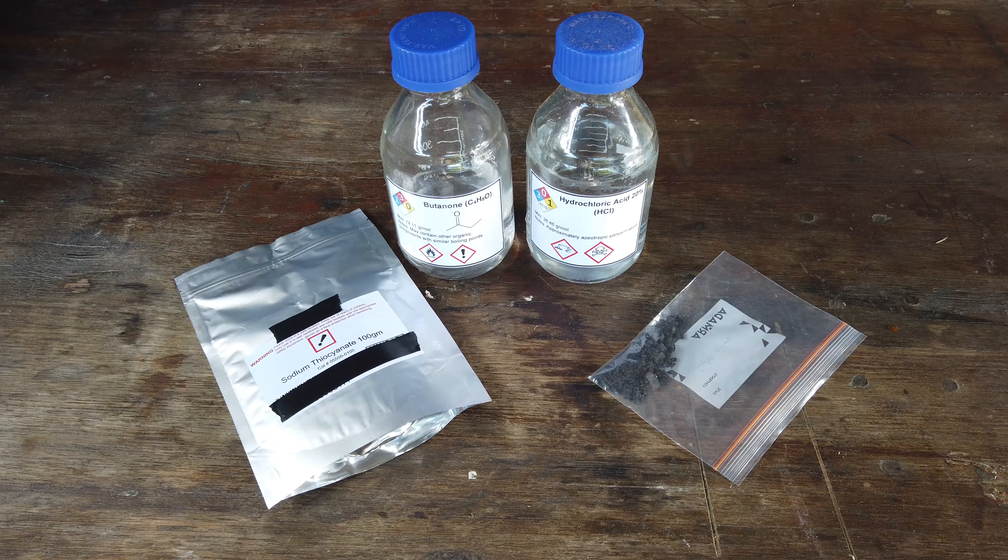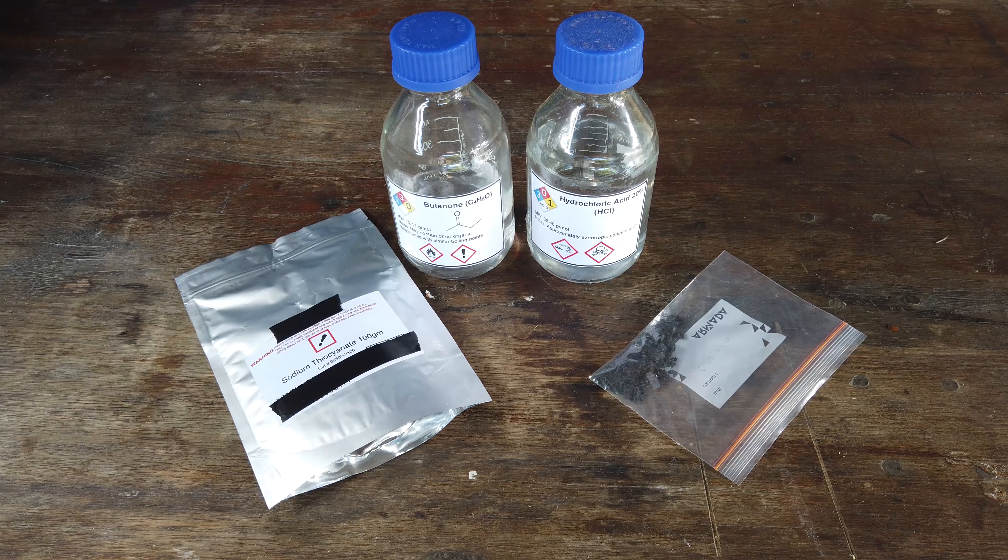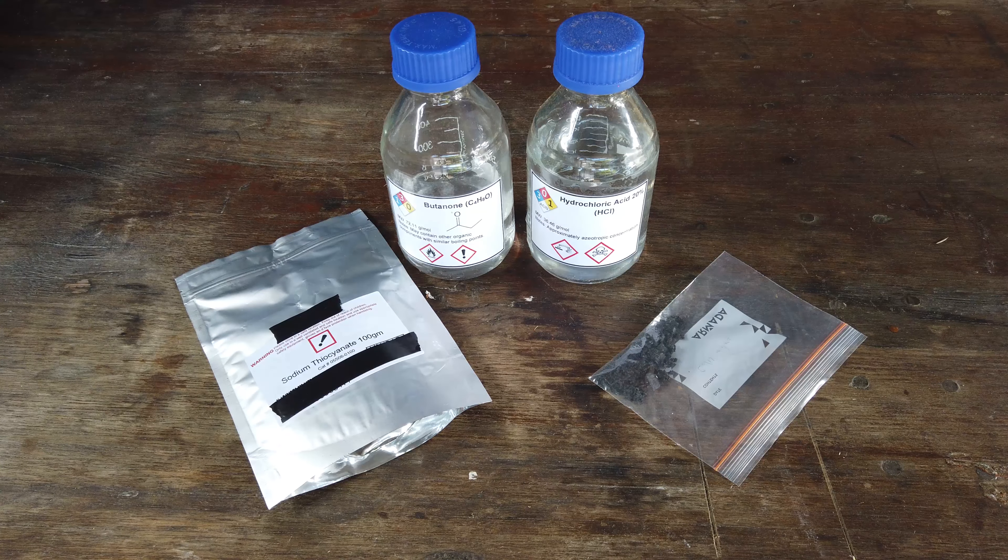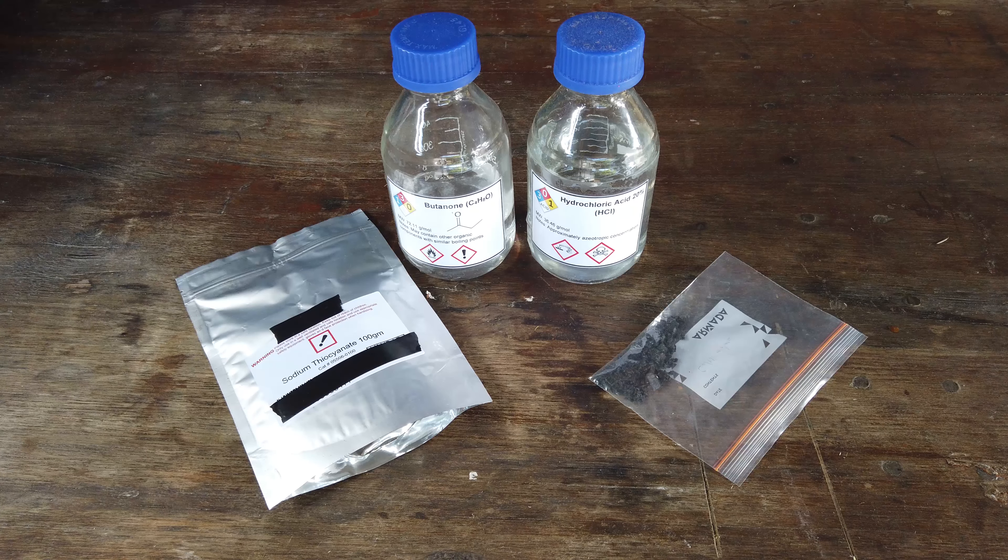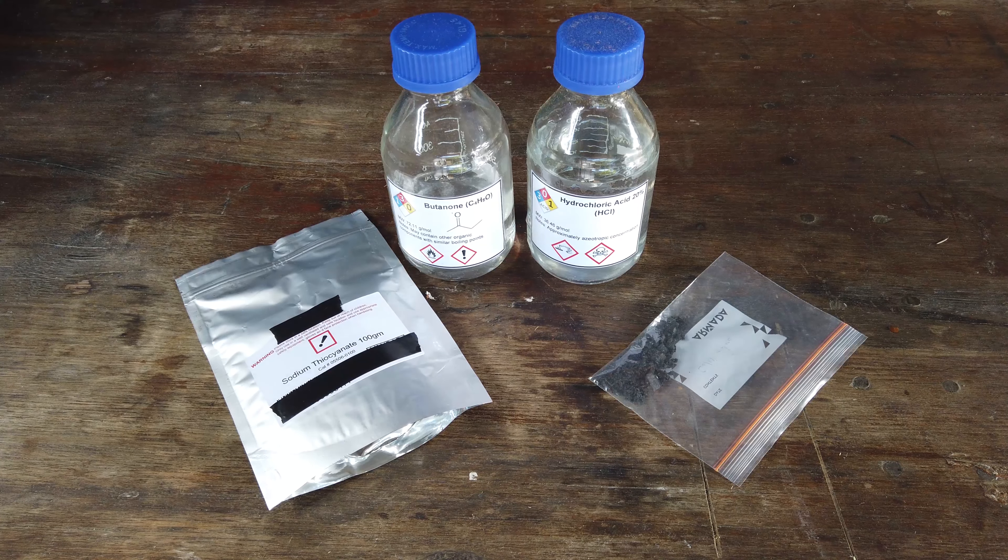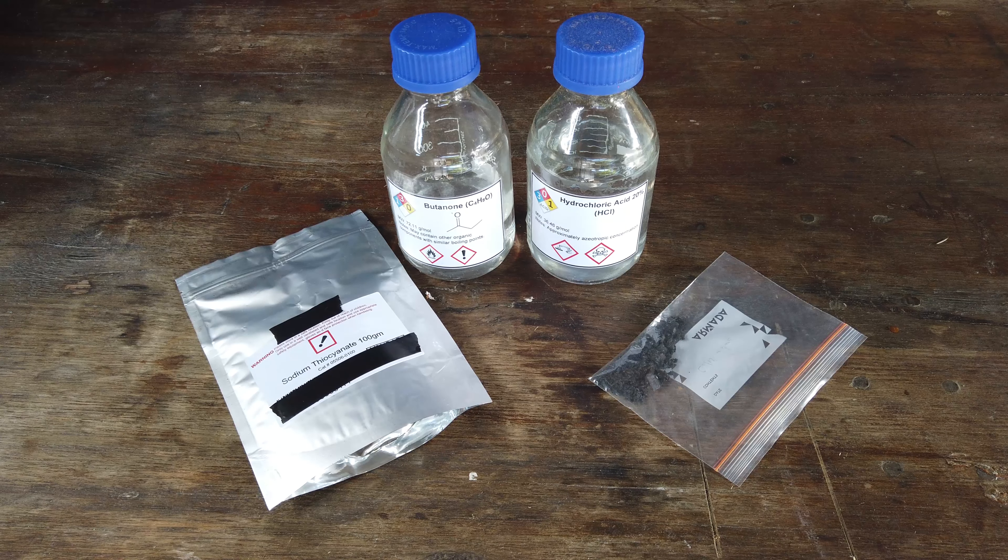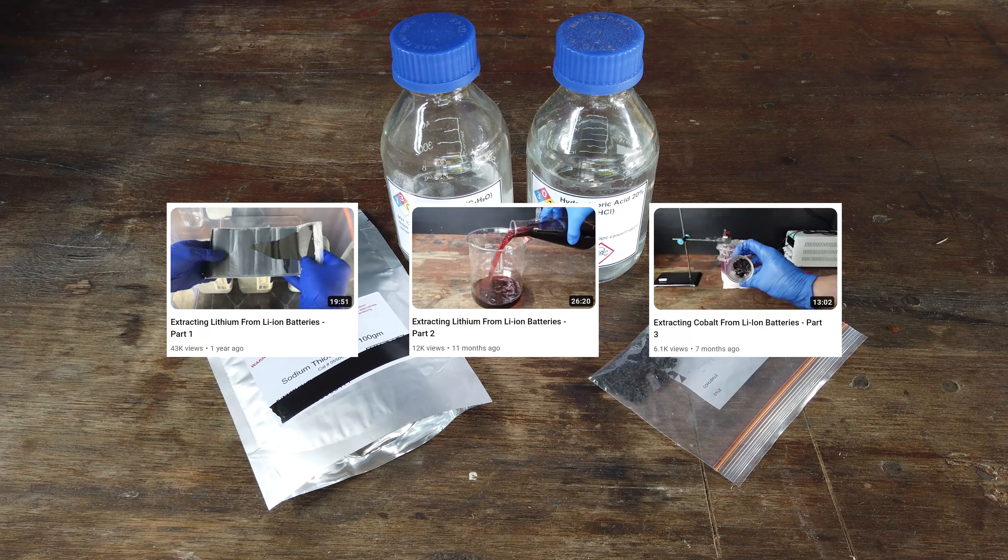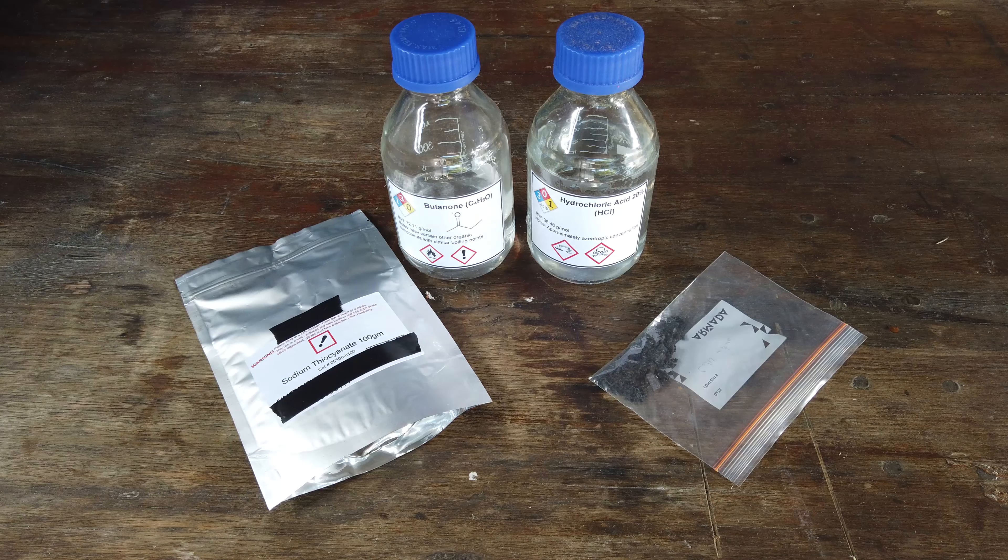I'm really quite excited for our experiment today. We've got some genuinely exciting chemistry to demonstrate. Our goal is to separate and purify cobalt from lithium-ion batteries. We're now focusing on purifying cobalt, and we're going to be continuing that extraction today.